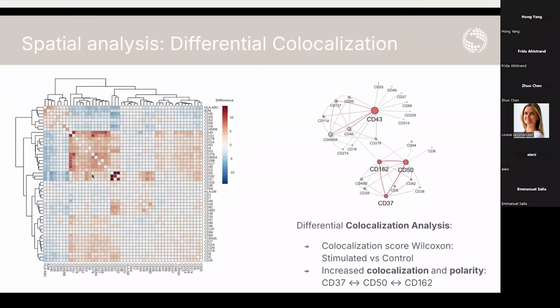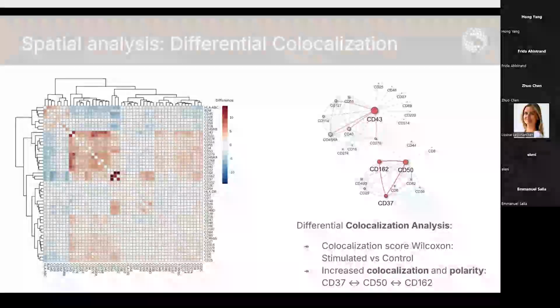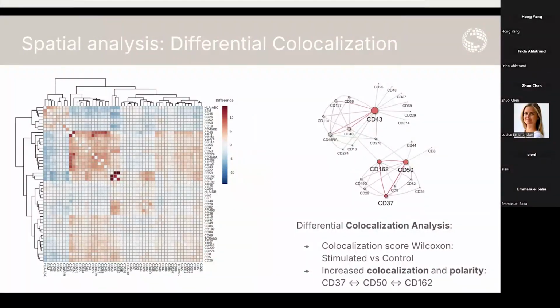Another thing that we see is on the opposite spectrum, the blue colocalization scores, which are negative, and recall previously show us that proteins are segregating, so moving away from one another. We see a lot of this happening simultaneously, and that makes sense because for proteins to move close to one another, they have to displace others. So this is what we're observing here.